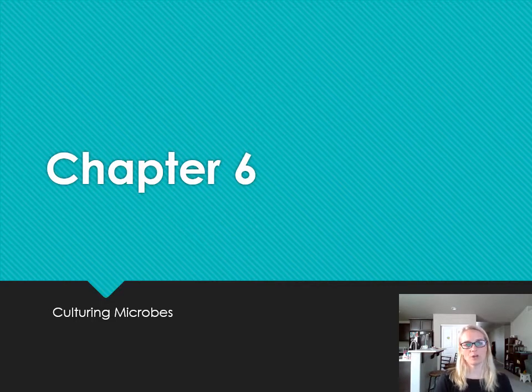The first half of the chapter, we just got done taking a look at the growth requirements as far as chemicals and energy and oxygen and nitrogen and other things, and physical growth requirements: temperature, pH, osmotic pressure, hydrostatic pressure, those types of things. Now, the second half of Chapter 6, we're going to take a look at actually culturing, growing microbes in the lab setting and taking a look at some of the considerations we need to think about for that.